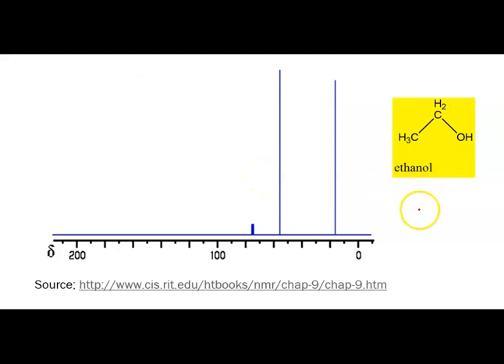Just another example here. You see the methyl group here, CH3, well insulated with hydrogens. That's going to be easier to see here, and that puts us below 20. In the previous example, we saw that the peak for a carbon was just above 20. But now we see this CH2 here, insulated with hydrogens, but because of its proximity to this oxygen, it's going to be further downfield. And then finally we see that 77 again, and that represents our solvent.